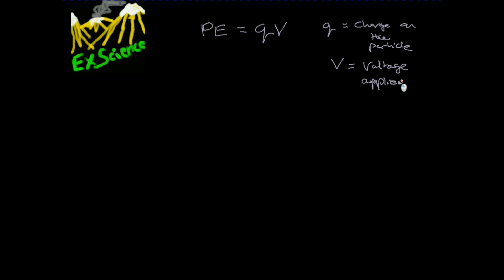The ions generated, now needing to be separated and detected, are accelerated into the field-free drift zone of the machine, which is a tube with a detector at the end. They enter this so that all the particles have the same kinetic energy. As charged particles, they are subjected to an electric field which gives them an amount of potential energy given by potential energy equals QV, where Q equals the charge of the particle, V equals the voltage applied.